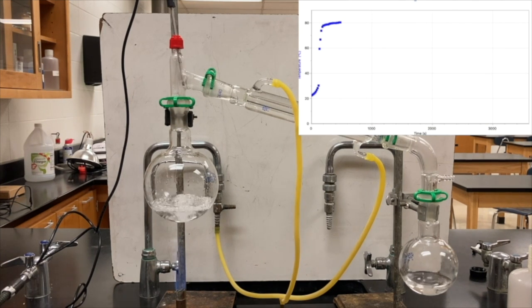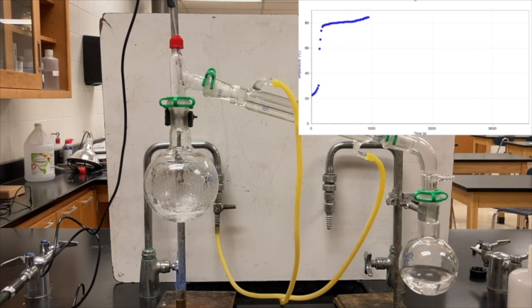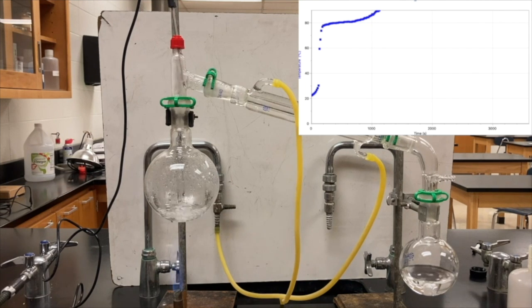So back to boiling, and I've sped this way up. You can see that the level in the cold end of the apparatus is getting higher as it continues to boil. And now we don't have quite so much of a flat spot anymore. Temperature is beginning to creep up as some of the energy is now being used to increase the temperature of the water while the alcohol continues to boil.